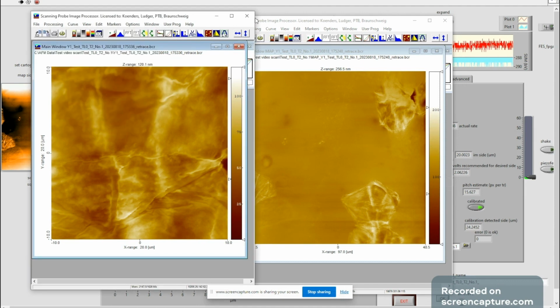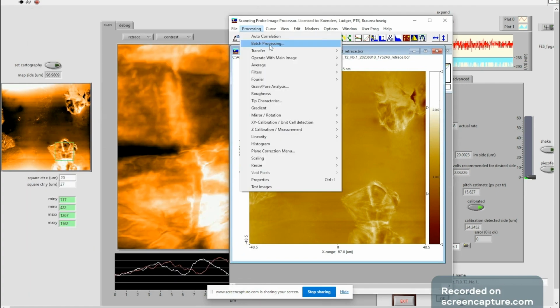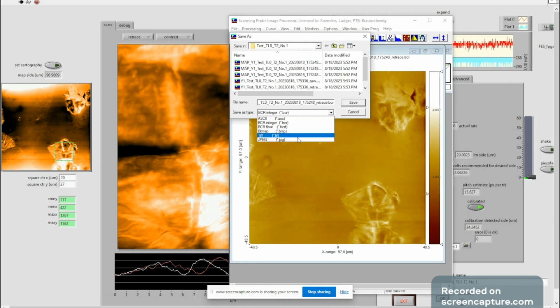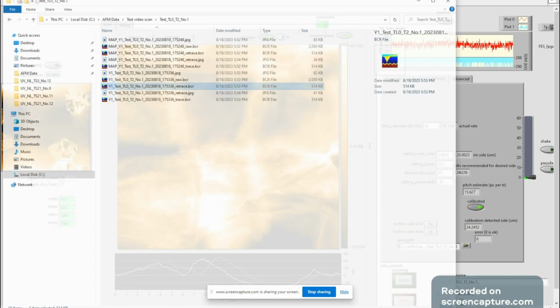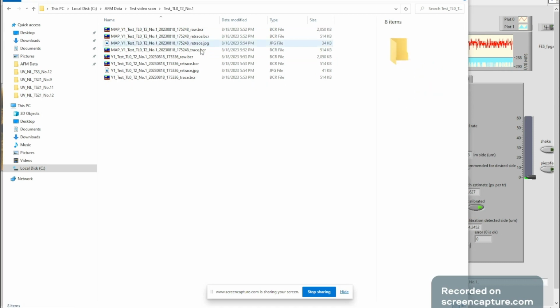map. We also want to save the maps. And when we have saved it as the new JPG, which is way better in details, we delete the previous JPG in the same folder. And that's how we scanned on this specific microscope to get a nano texture image.